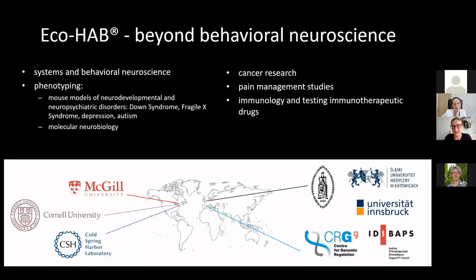A very last word. I have been talking a lot about behavioral neuroscience because this is what we do, but Eco-HAB has been used way beyond that. Specifically, a lot of the labs that we work with and collaborators have been using it to phenotype various neurodevelopmental and neuropsychiatric mouse models. And also specific molecular mechanisms and pharmacology experiments have been done to assess phenotypes and how animals look in terms of their social behavior after specific treatments.